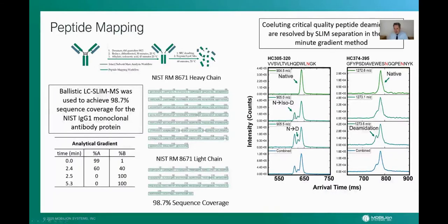We can actually see both forms, both conversions here, because each of those is drift time resolved, as you can see in these stacked plots. We go to this second peptide, in this case with 2 asparagines, and we're actually seeing just a single conversion at this point, that we can see separated in drift time.